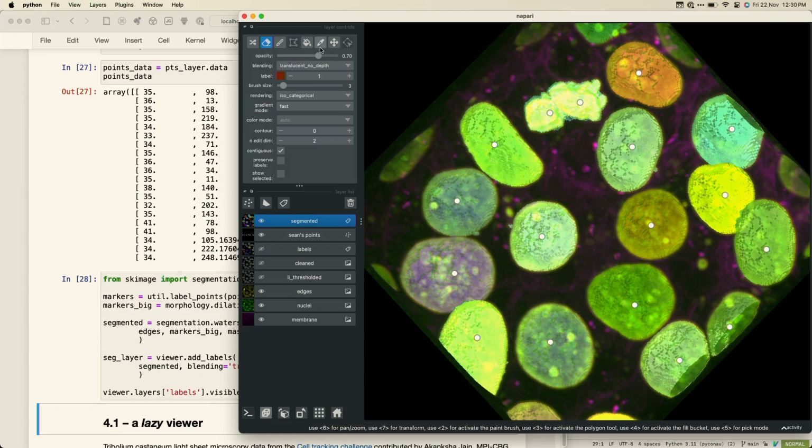Then I can use the color picker to pick this one. And then I'm editing in 3D. You can fill it. And then segmentation's done. So that's the sort of thing that you can use manual annotation to go from your 90% solution to your 100% solution really quickly.